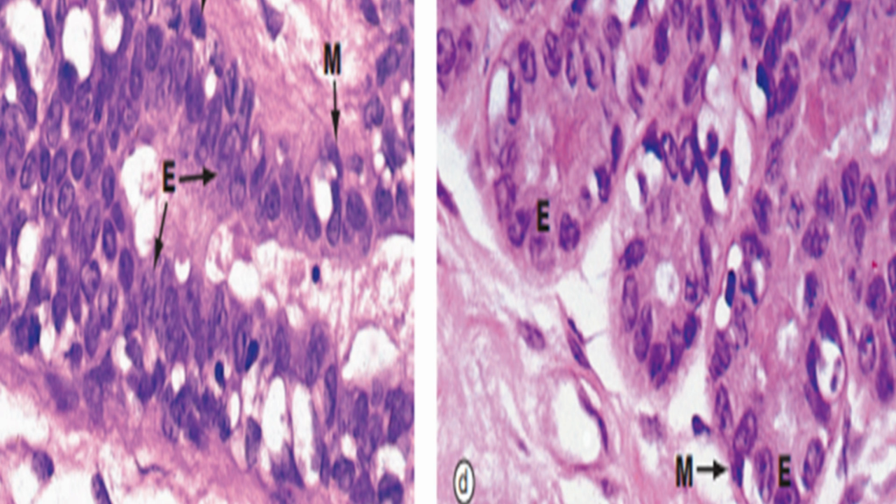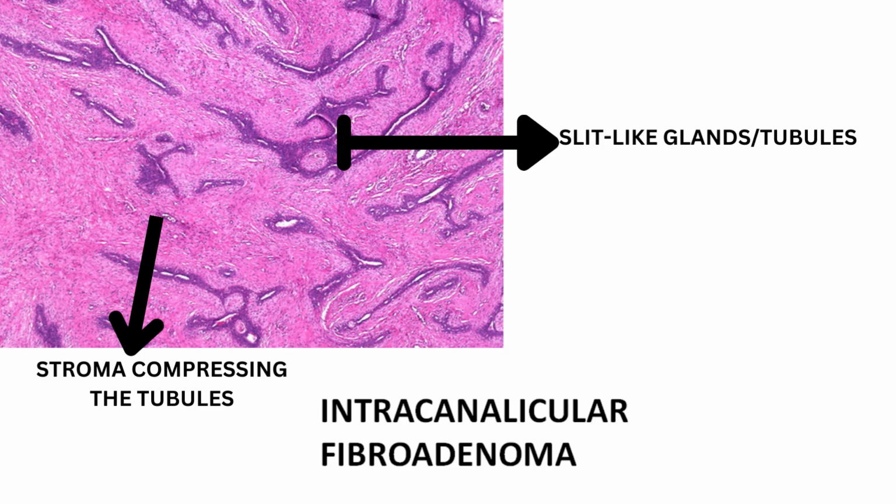And then we also have the basement membrane, the supportive cells. We also have the myoepithelial cells. The epithelial cells can be columnar or cuboidal as well. Myoepithelial cells are usually stellate and have pale cytoplasm, and they surround the duct cells. I'm not going to discuss every entity, of course, but I'm going to discuss the most important entities.